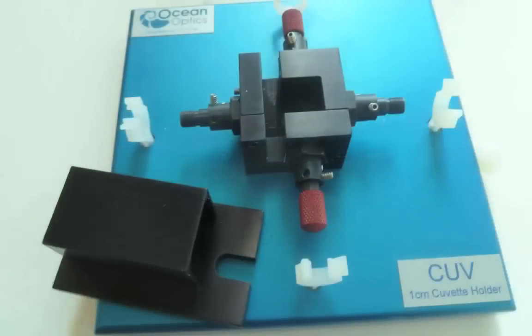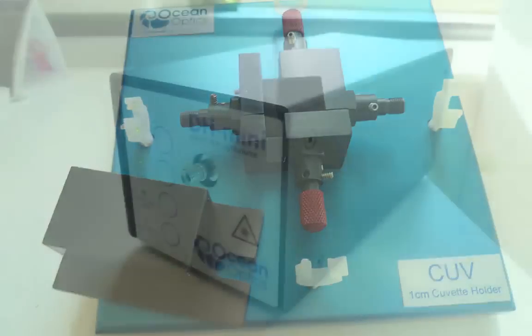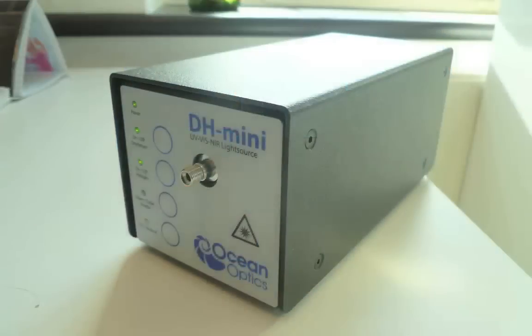A CUV cuvette sample holder with two 74 UV lenses positioned opposite to each other. The DH-mini light source which contains a halogen lamp emitting in the visible range and a deuterium lamp which emits in the UV.